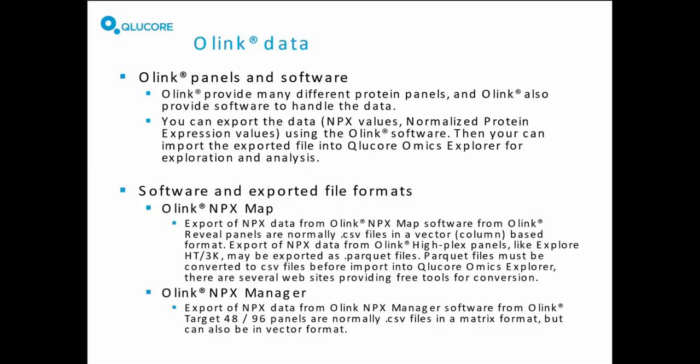There are different types of software. One is called Olink NPX Map, and that can be used to handle Olink Reveal panel data. You can export that data into CSV files in a vector or column-based format. We'll have a look at that in an example.